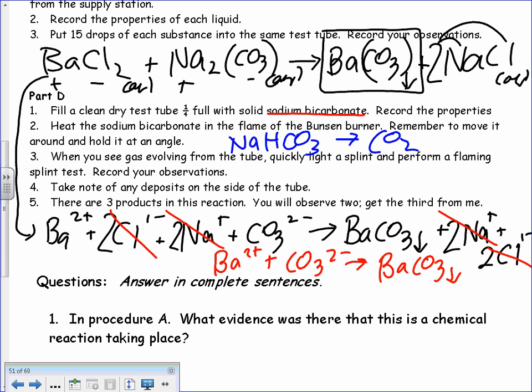And then there's another one that's kind of weird, and I've tried to make it work, but it doesn't always work all the time, so I'll try it again. But it has a bark to it. It's called the hydrogen bark. So if it makes hydrogen gas, it makes like a bark sound. So I will not do the bark sound again. But there you go. Okay, so it sounds like a dog. That's why it's called a hydrogen bark test.